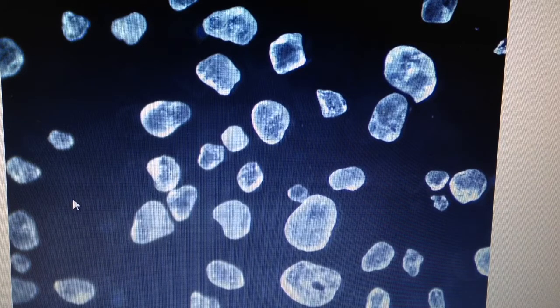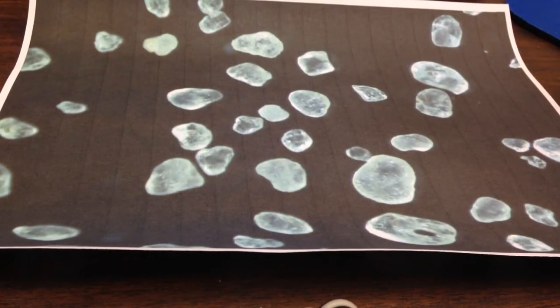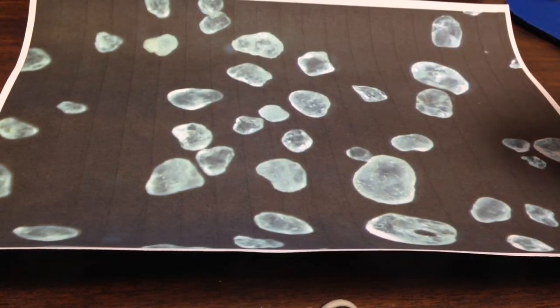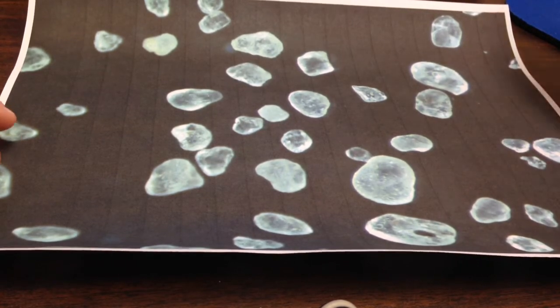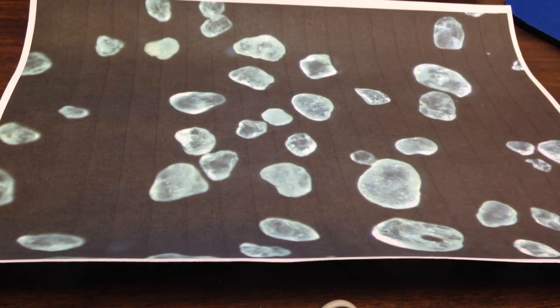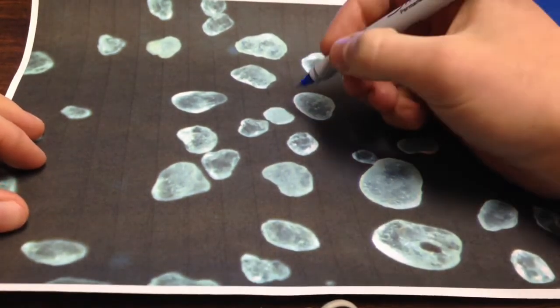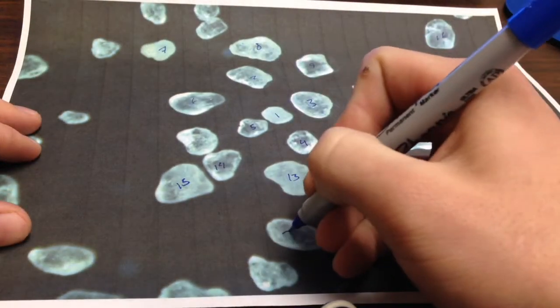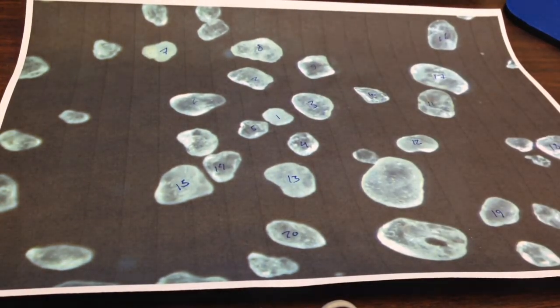At this point, we go ahead and print off an image. Now with the printed image in hand, we'll go through and number particles 1 through 20. We like to typically start in the middle on the way out, that way we have a good random sampling and we're not just skipping over ones — we're collecting the full image. Go ahead and start in the middle, and there's all 20 numbered particles.